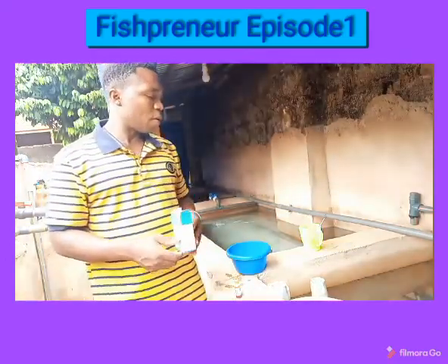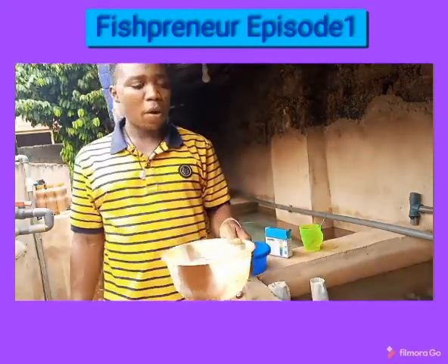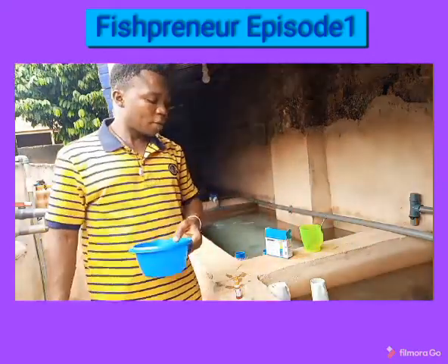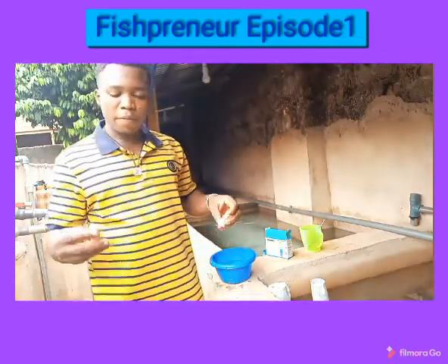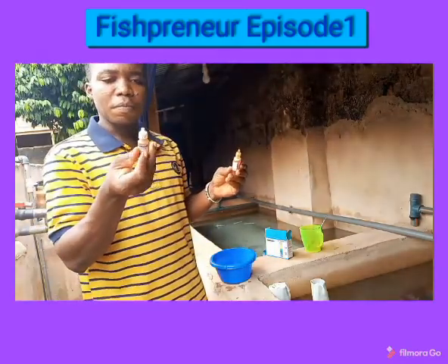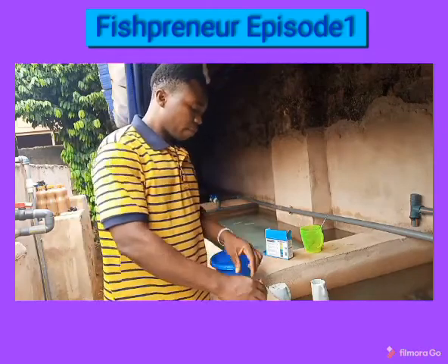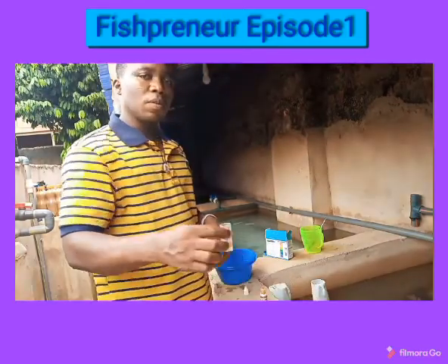Here with me I have untreated water from the borehole, and I'm going to collect water from the hatchery as well. This water is from the hatchery and this is from the borehole, so we are going to test both. I have two different test kits that I normally use — the name of this one is Water First pH Reagents and the other one is Aqualush pH Test Reagents. Let us start with the one from the borehole.